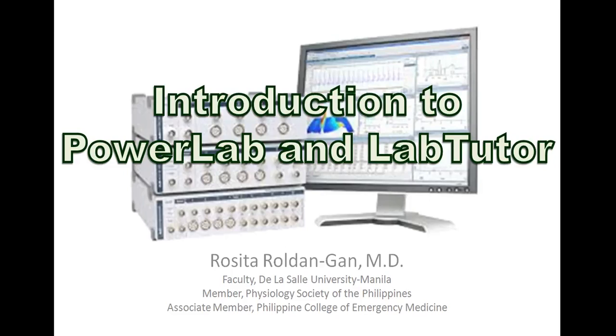Welcome. For this video, we will be discussing Power Lab and LabTutor. So we will show you the basic setup of a Power Lab, and also we will have a walkthrough on how to use LabTutor in our physiology laboratory. I'm Dr. Rosita Roldangan from De La Salle University. Let's start.